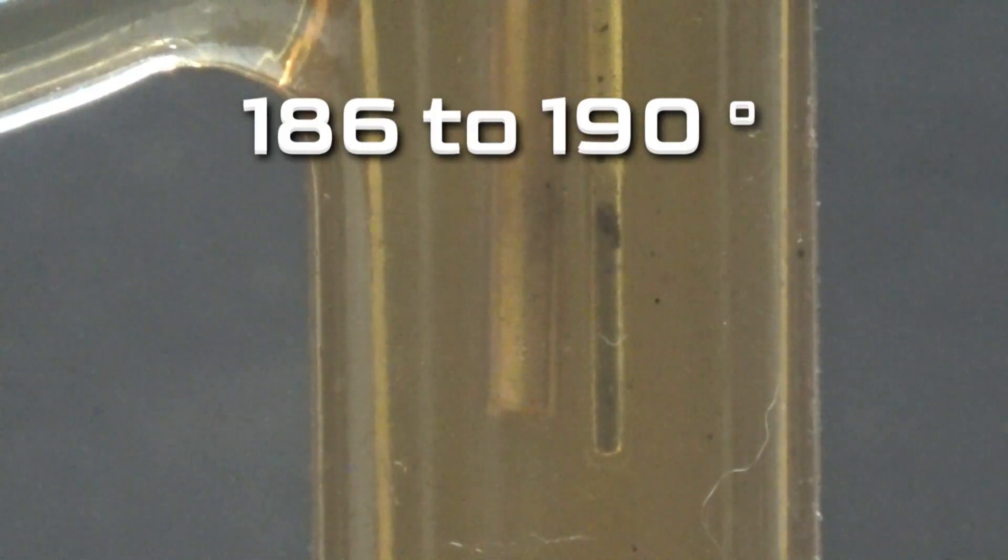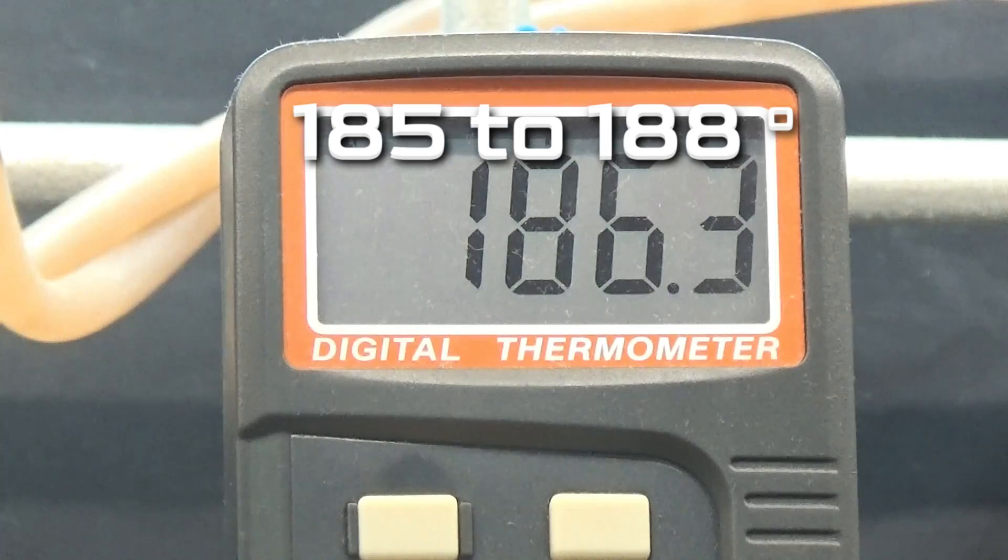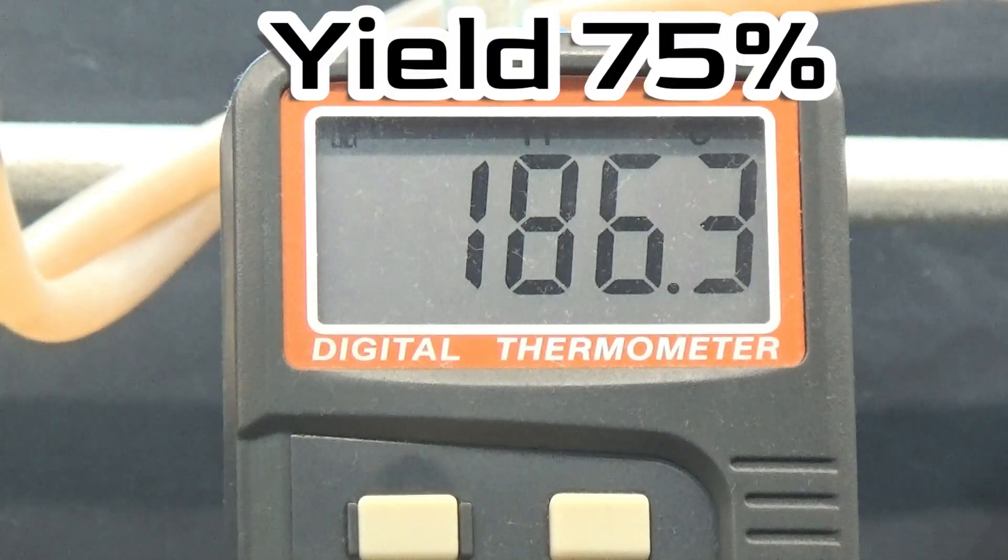The melting point of the acid has been determined with a result of 186 to 190 degrees. The melting point according to literature is 185 to 188 degrees, a good result in the purity of the acid obtained. The yield of this operation was 75%.